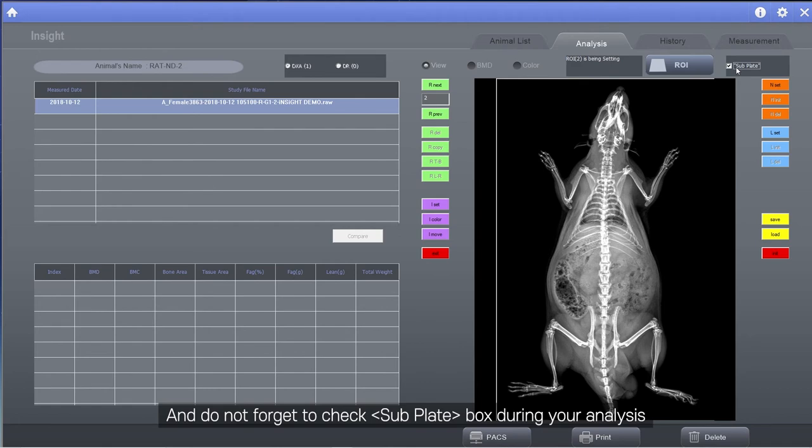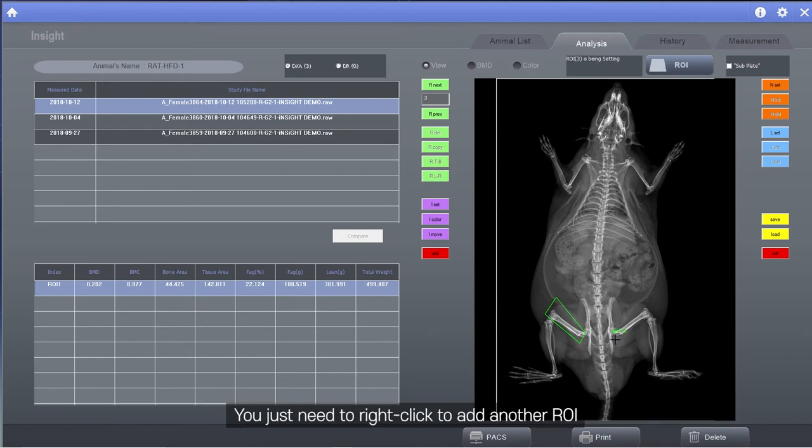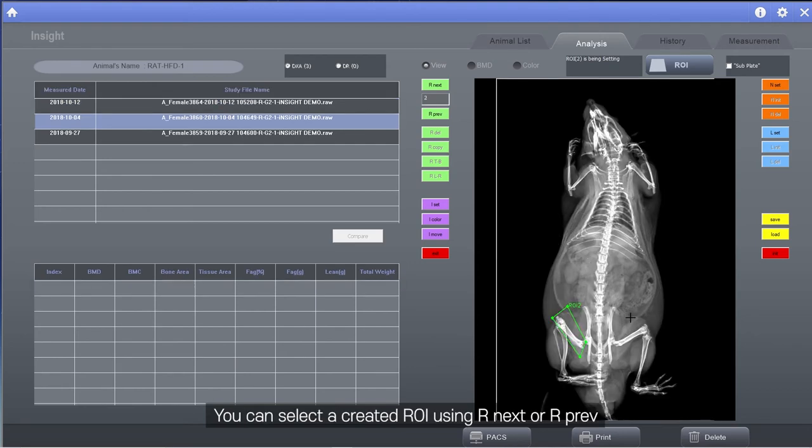And do not forget to check subplate box during your analysis if you applied an acrylic subplate for measurement. In analysis window, you can create an ROI with multiple left clicks and mouse movements. You just need to right-click to add another ROI. You can select a created ROI using RNext or RPrevious. Once the ROI is selected, it'll be changed in red.